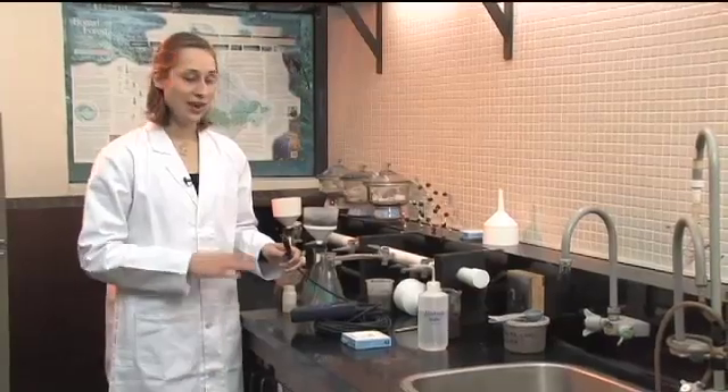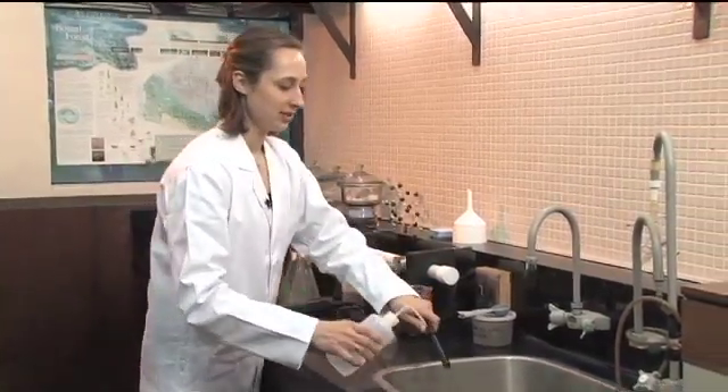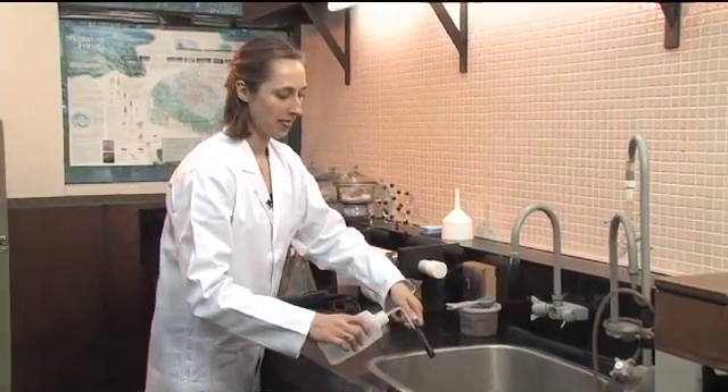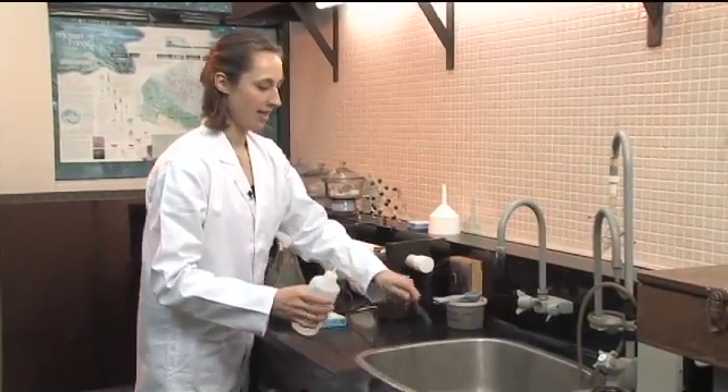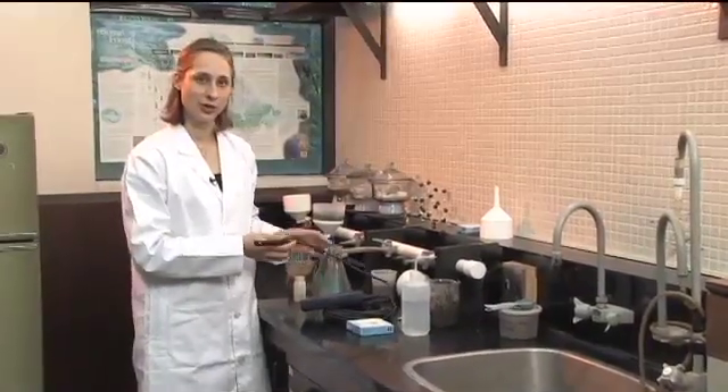That's a pretty low value. Four decisiemens per meter is considered a toxic level for most plants, and even two decisiemens per meter can be detrimental to plants that aren't tolerant. After you're done with your reading, rinse off your probe with some distilled water, and then you're ready to take your next measurement or to store your probe.